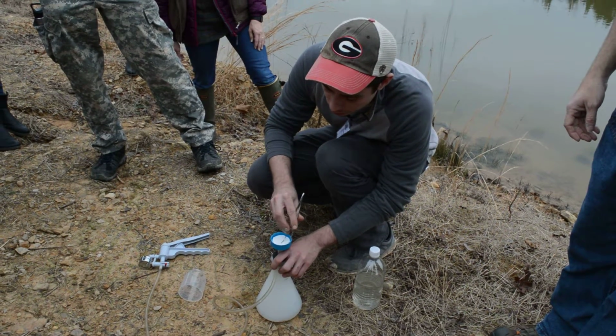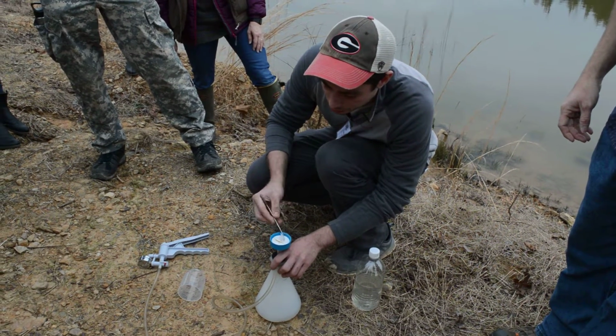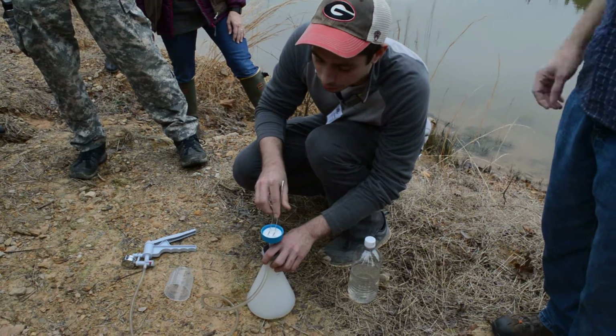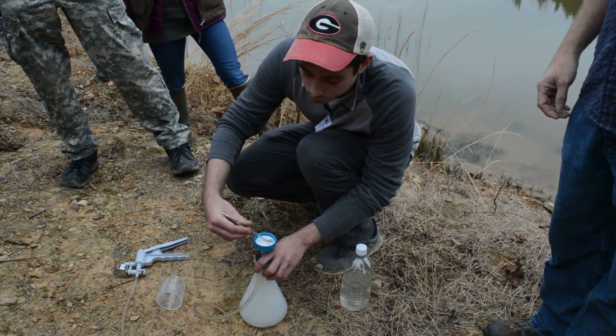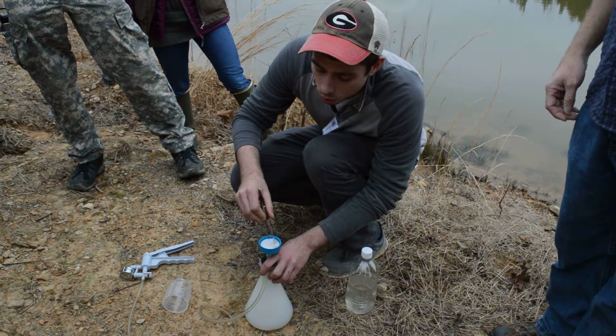Right, like fold it over and do that a couple times, and you can fit it into a tube with ethanol. And then it's nicely folded and not ripped up. Yeah, then it's easy to take out. But then once it's in ethanol, now it's fixed. It can sit there and wait. Well, sort of.